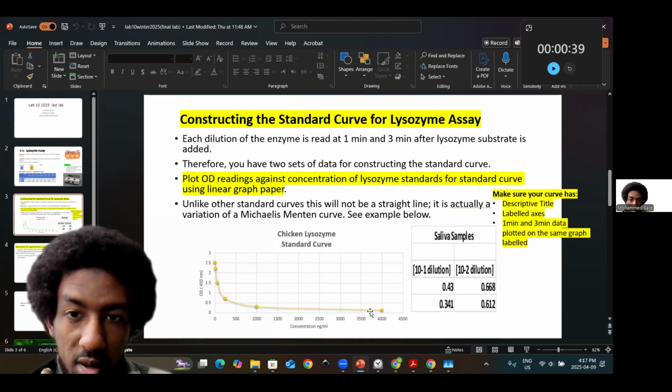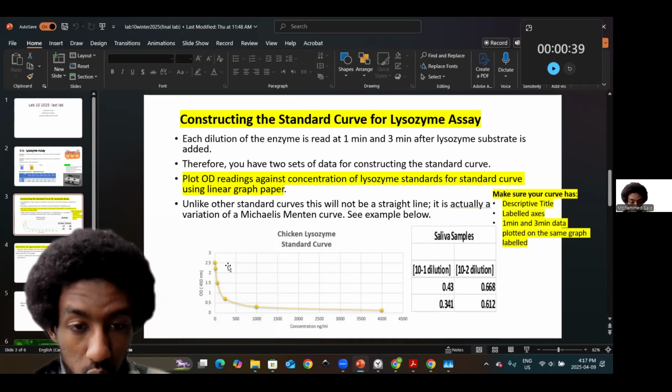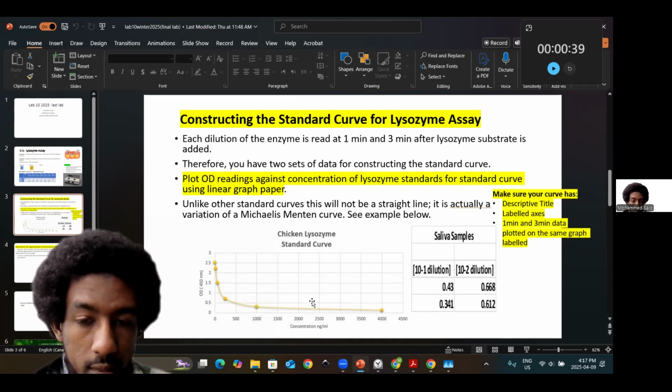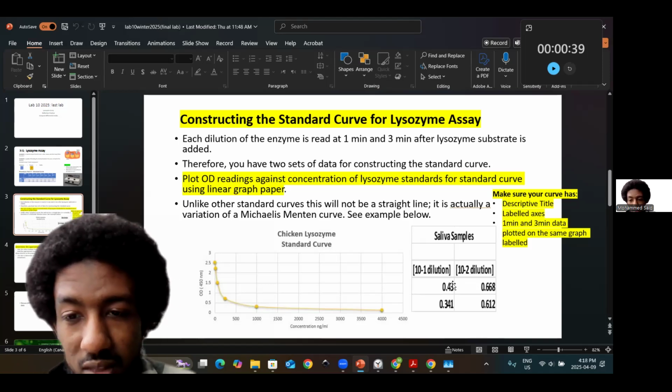As I mentioned from our last lab in person together, you can plot these values in Cartesian, i.e. regular increments, not semi-log. With turbidity, you're plotting them down like a smooth curve, and then you would interpolate, right? Based on what I've shown here. And I want you guys to do this. If you haven't sent it to me, you can include it in your comments, right?